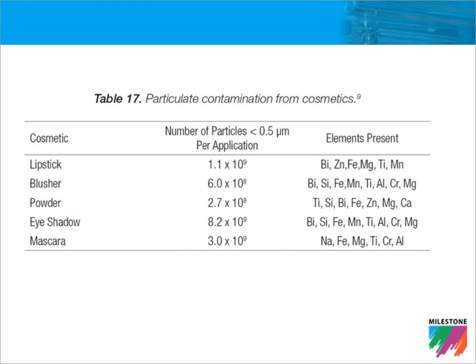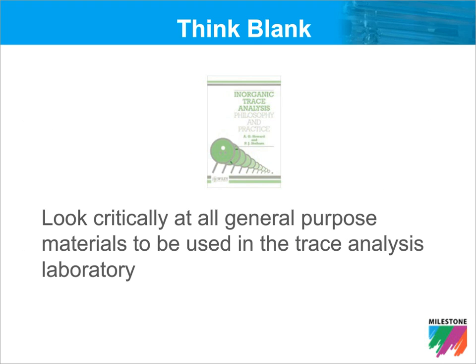In other words, we should look critically at all general purpose materials to be used in trace analysis. The effects of contamination from air, apparatus, containers, and reagents have become increasingly important as the sensitivity of analytical methods has lowered detectable limits to the nanogram level.